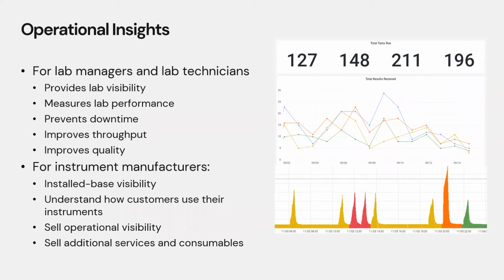You can improve the throughput of your tests if that's important to you. And very often you can also do analytics to improve the quality of your test outcomes. Those are the things that are welcomed by technicians and managers. Other things can be added to it, such as automating QC, automating checking different parameters of the instruments, etc.